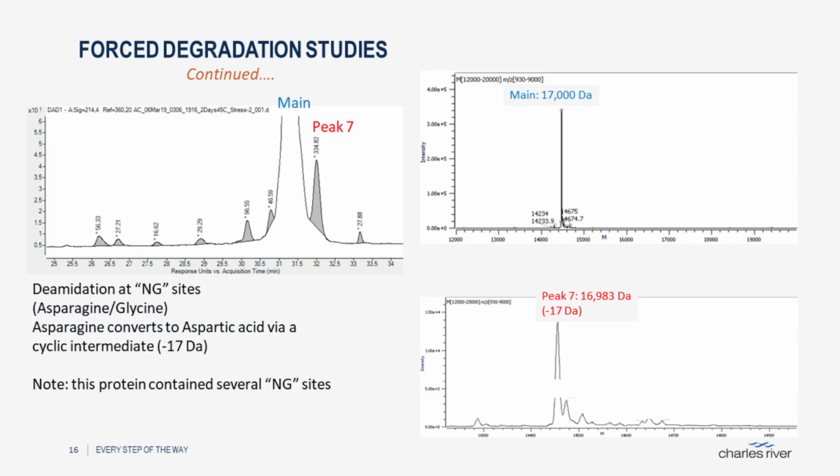Now, once we start talking about proteins, of course, we're moving away from working with a monoisotopic mass and really now using average mass. So this particular protein is up around 17,000 Daltons. And so we're not really using all the decimal points here anymore to say exactly 17,000.6693 Daltons or anything like that. But nevertheless, these peaks can still be characterized on the basis of some known types of reaction chemistry that happens to proteins or various amino acids. So in this case, I just am pointing out this one peak here, peak 7.